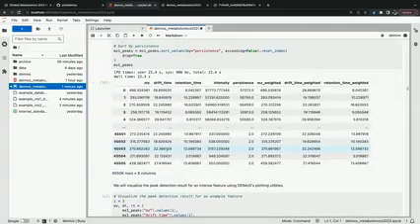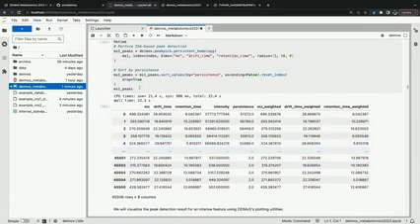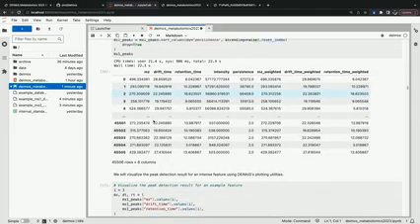For peak detection, we included a little timing notebook magic here to demonstrate the timing, and you can see that the peak detection is fairly fast. It takes a matter of seconds.